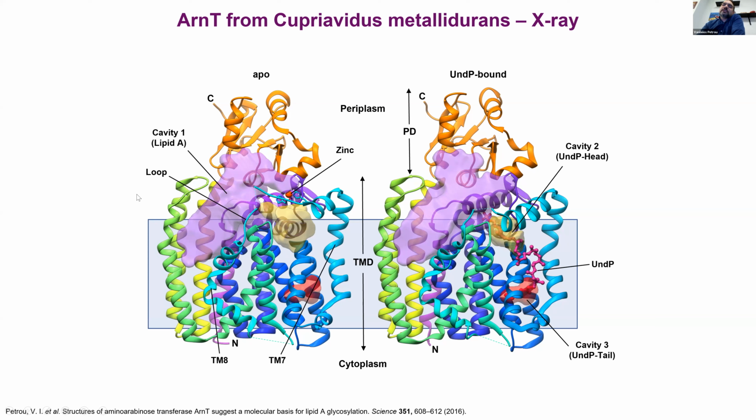The molecule has a few cavities which seem to participate in coordination of the two lipidic ligands that it utilizes. We also observed a very clear conformational transition when the donor substrate binds, where the periplasmic helix shown over here has only 2 turns, but in the bound conformation is extended by an extra 2 turns. And we think that locks the lipidic substrate within the active site.